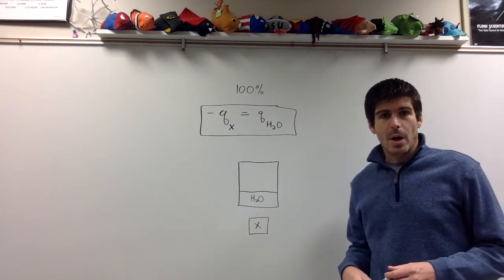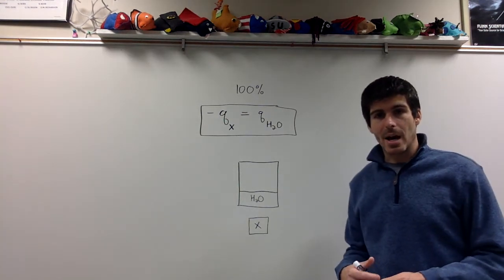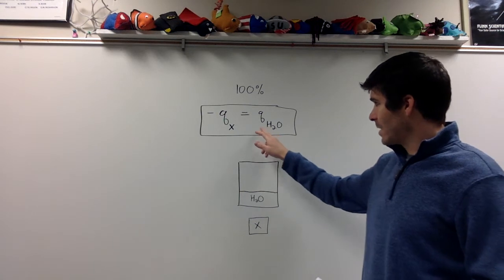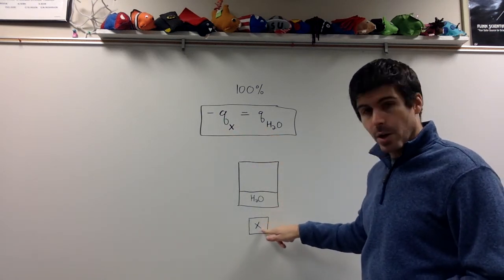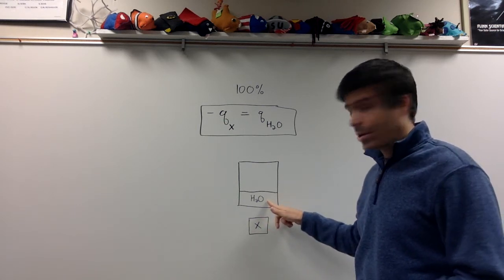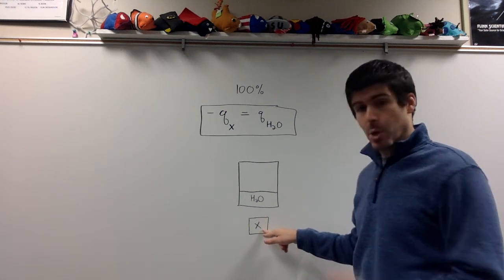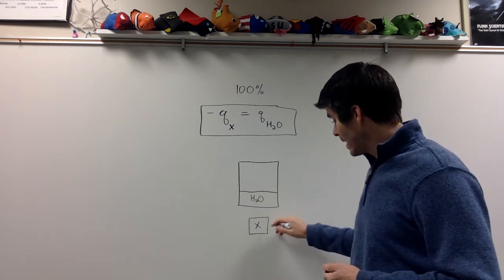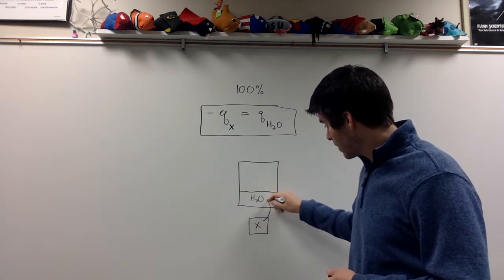So our next lab is called calorimetry. Calorimetry is the study of heat transfer. What we're going to do is utilize this principle here. We have two bodies, an unknown, which can be lots of different things, and we always use water to capture the heat. Whether this one is hot or we burn it, we can take the heat that comes out of this and trap it in the water.